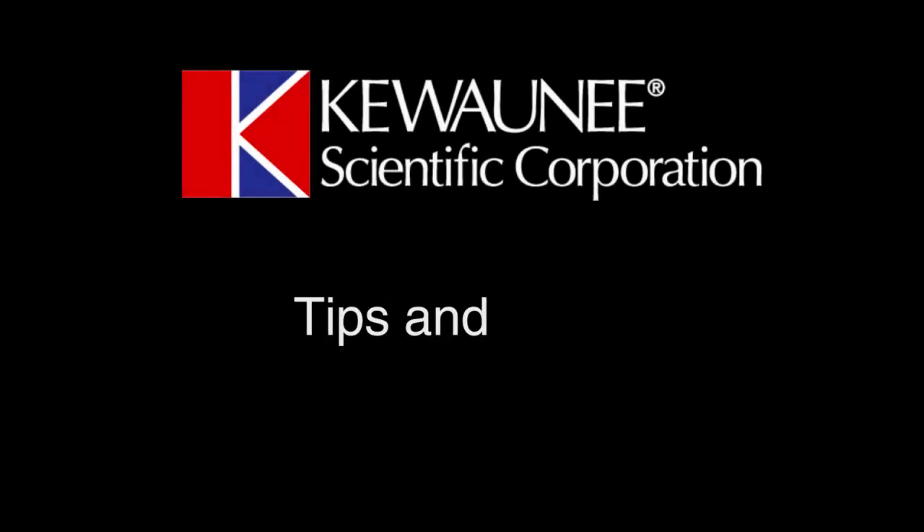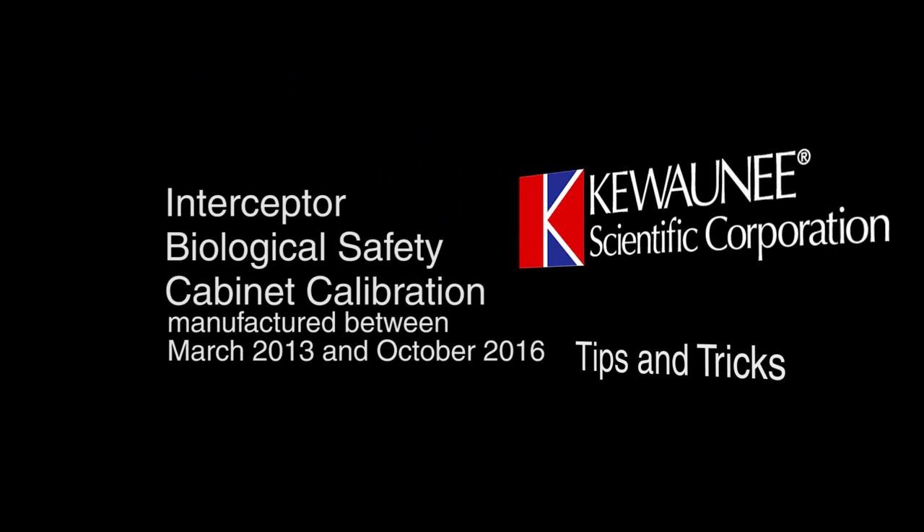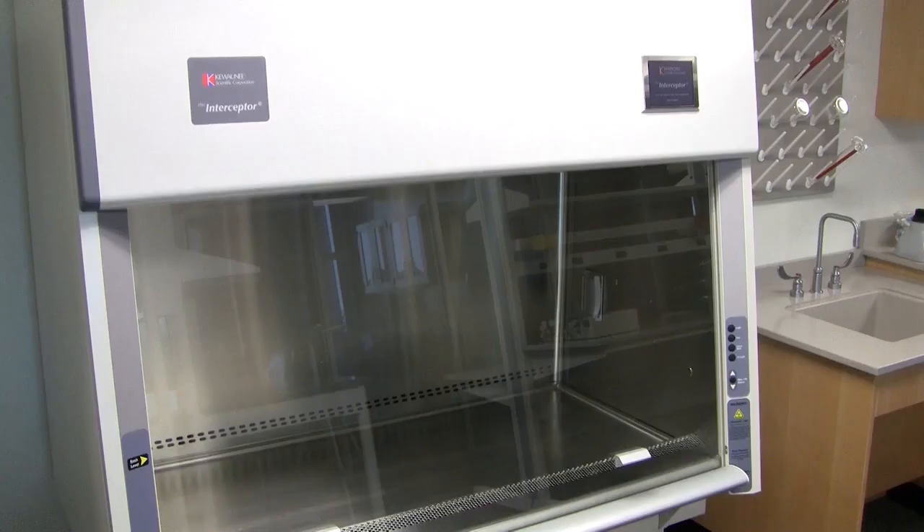This is Kewaunee Scientific Tips and Tricks. This video covers calibrating our Interceptor biological safety cabinets that were manufactured between March 2013 and October 2016. Calibration is only necessary if the screen does not match the inflow feet per minute after having the cabinet balanced. We will be focusing on the screen and control panel, highlighted here.